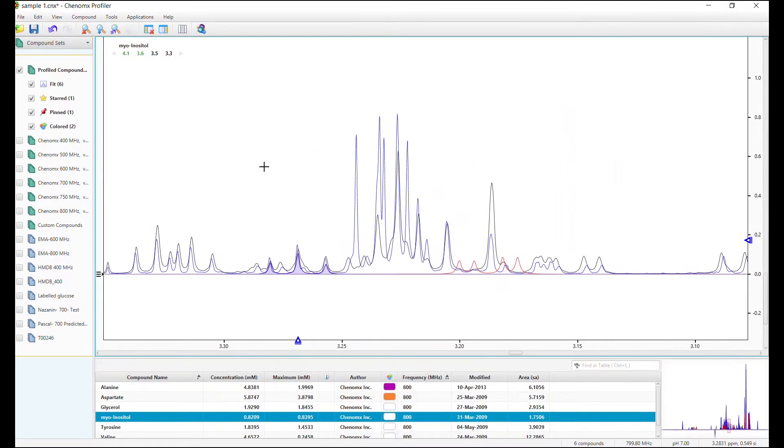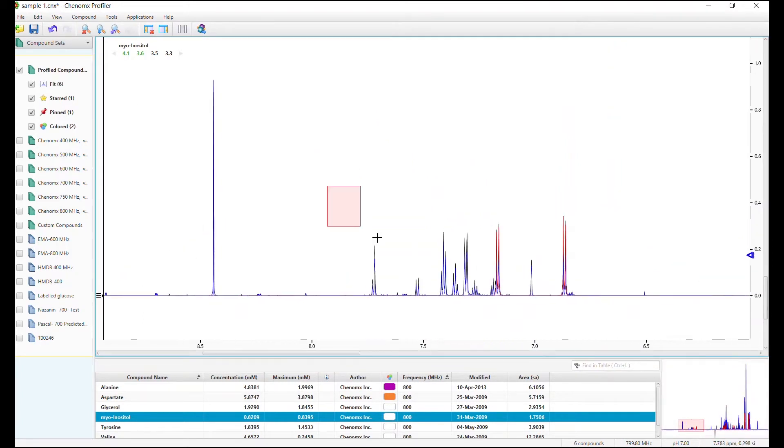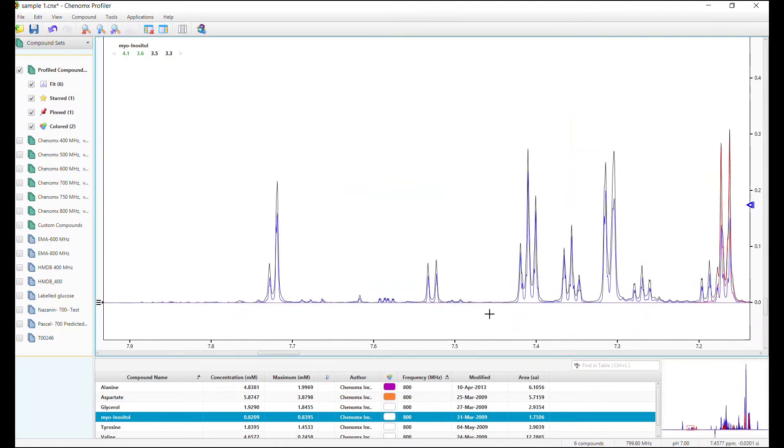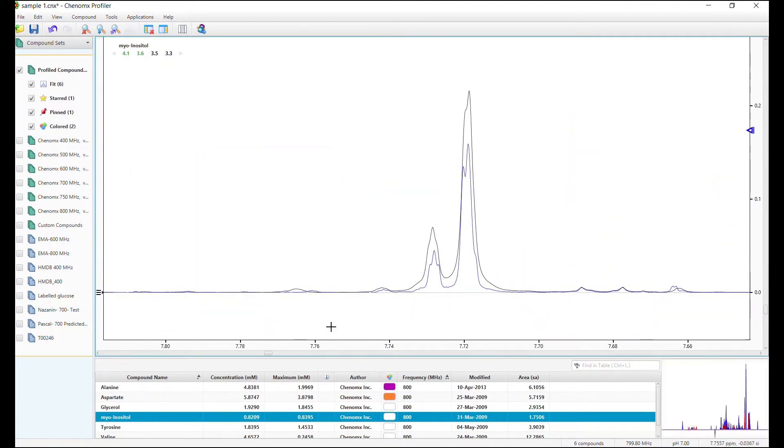See here, our overlay reveals the peak at 7.7 ppm has lower concentration in the second spectrum.